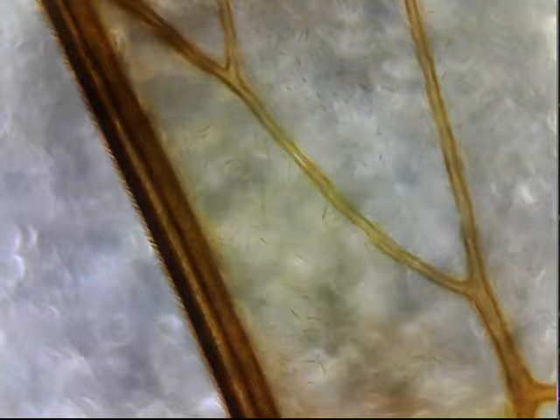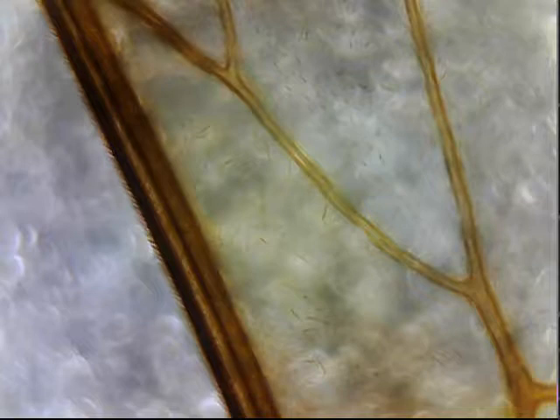It froze again. It's not doing well unfortunately. I can't control the lag — I don't know why it's lagging. My computer really shouldn't be lagging with a microscope, which means either it's some weird kind of bug or the microscope itself is lagging. And I don't know how to fix either of those. The microscope is not that great, you know.